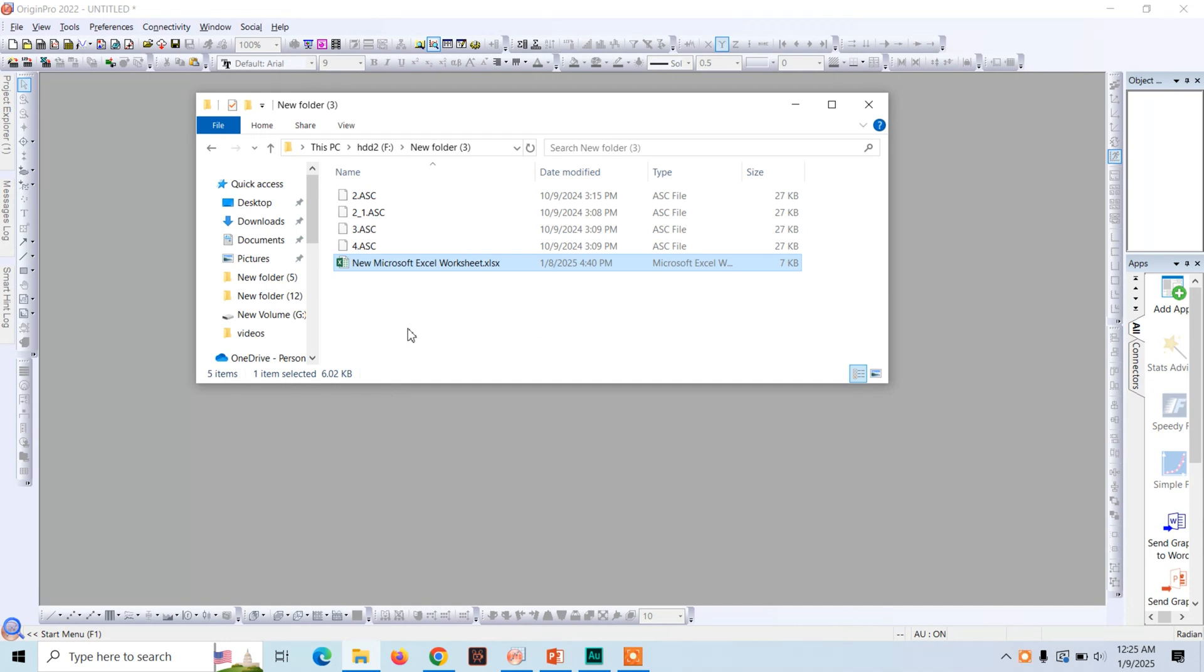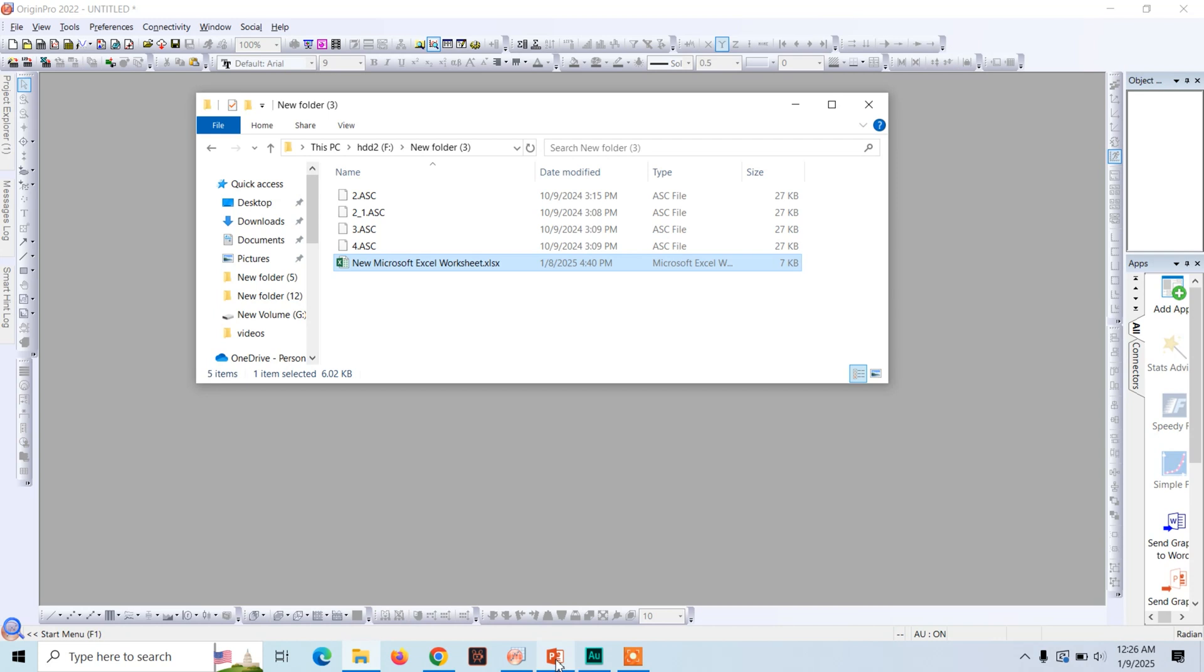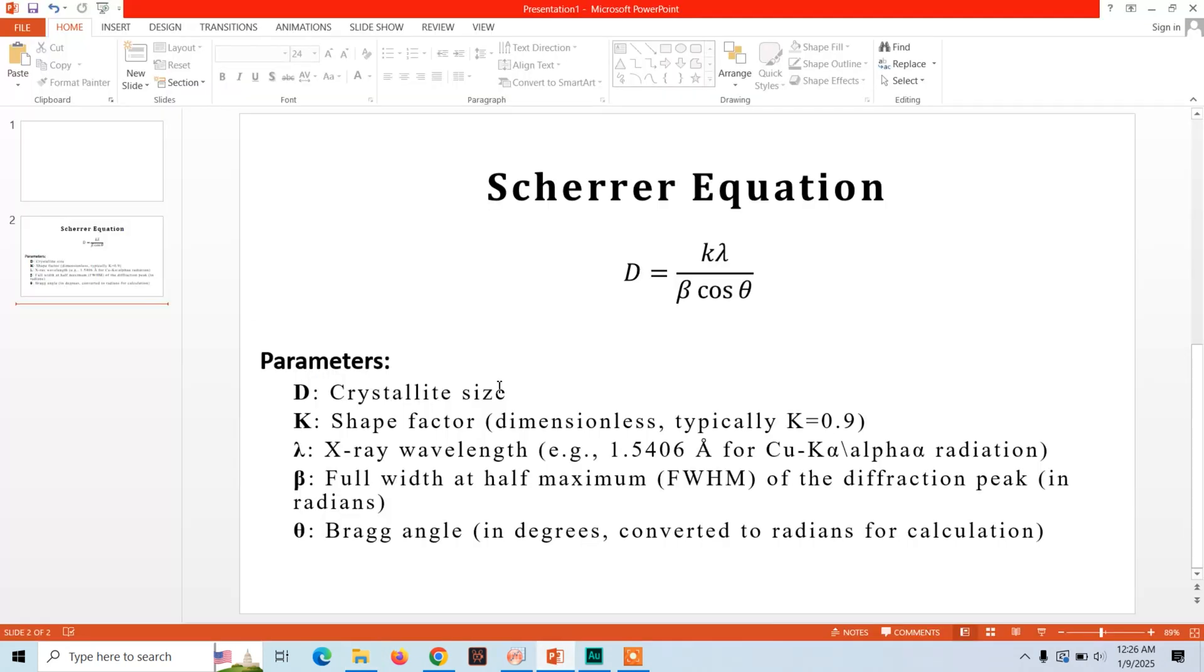Hello, welcome to GTO. Today we are going to calculate the crystal grain size from XRD data. We will use Origin for the calculation of full width half maxima and we will use Microsoft Excel as a calculator for solving the Scherrer equation.